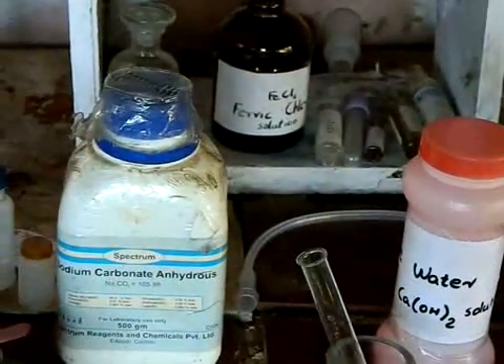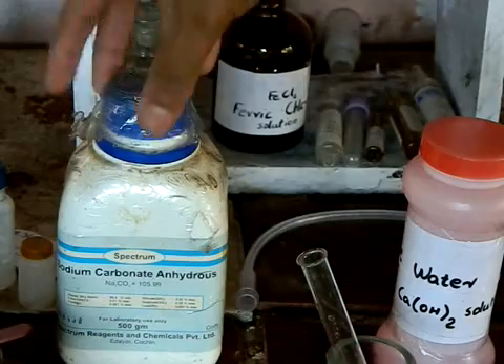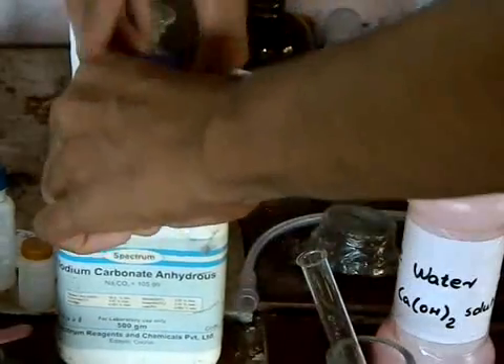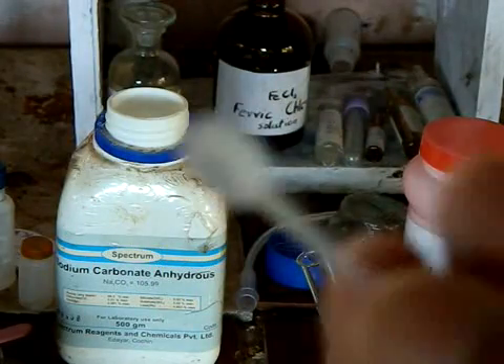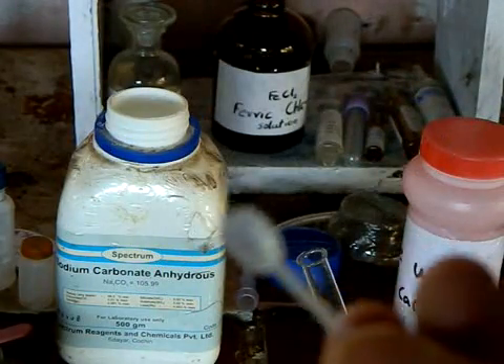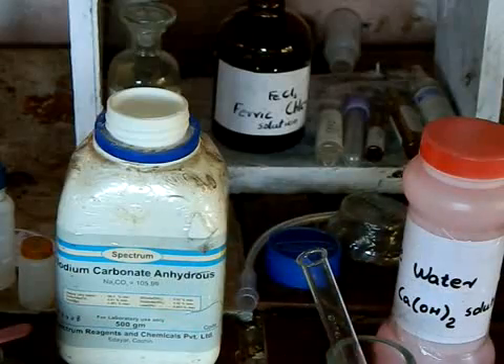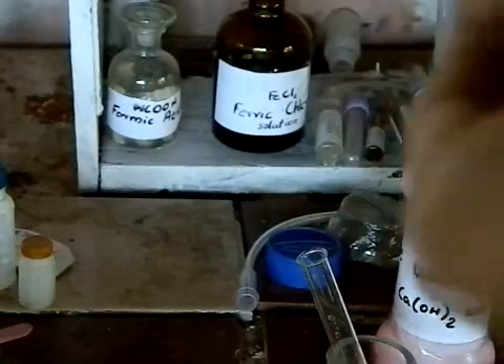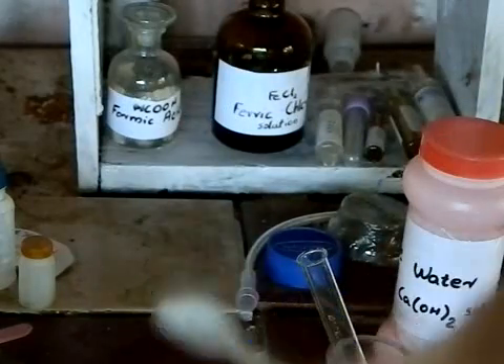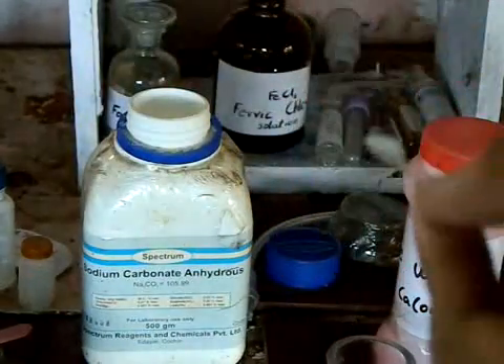I will take a little of the sodium carbonate. I am using a mini spoon — with the help of that, I will be taking a very little of the sodium carbonate into a clean test tube.